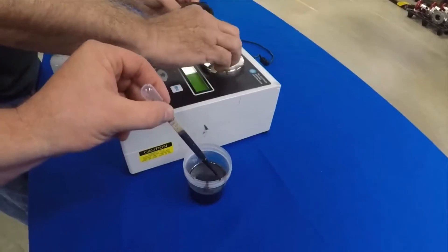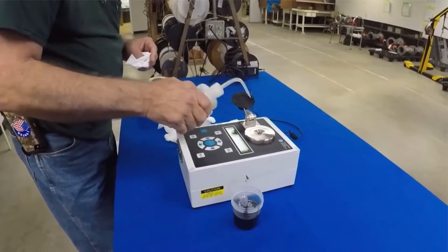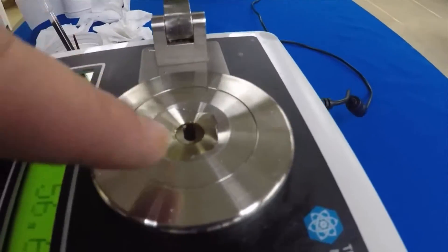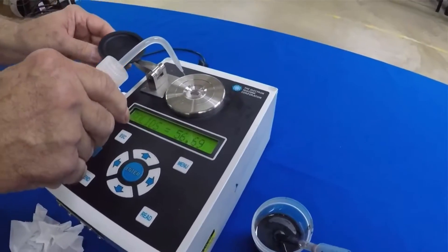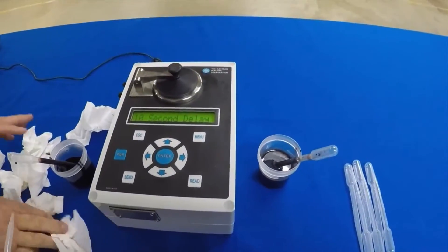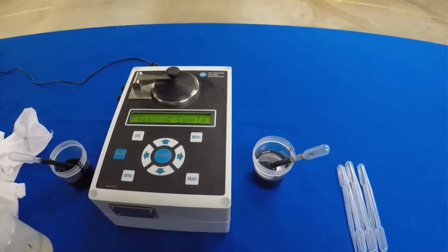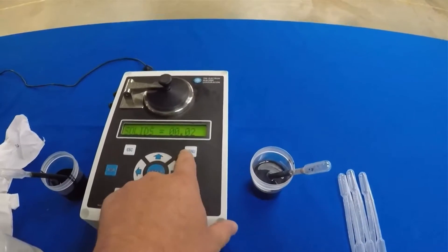We're going to clean that off and go to the weak liquor. You can see there's still some residual left — we want to make sure it's all nice and clean. You can always verify that you've got it clean by putting a water sample back on there and it should read back at zero. Before we put the 15 on, we'll do that — and as you can see, we're back at water. The unit is still reading really well.